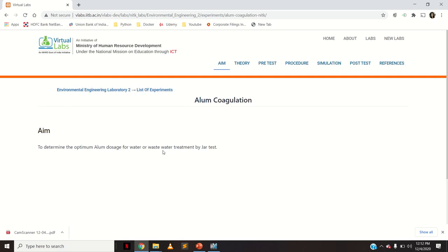Since alum is the coagulant, depending upon the turbidity the dose of the coagulant will vary, and that optimum dose of coagulant is determined with the help of the jar test. That is what this experiment is about.